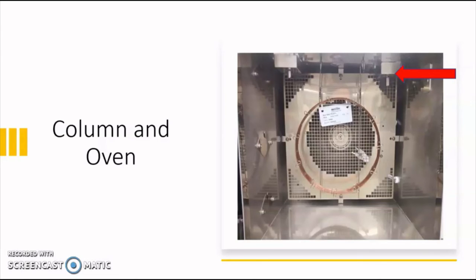Column health is important for good chromatography. Binding sites wear out over time due to routine use and buildup of residues in the system. Routine maintenance can extend the life of the column, however, it will too need to be eventually replaced.